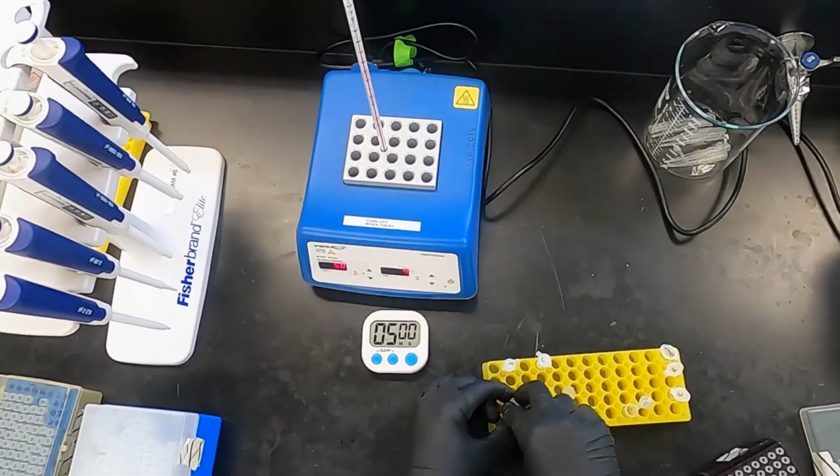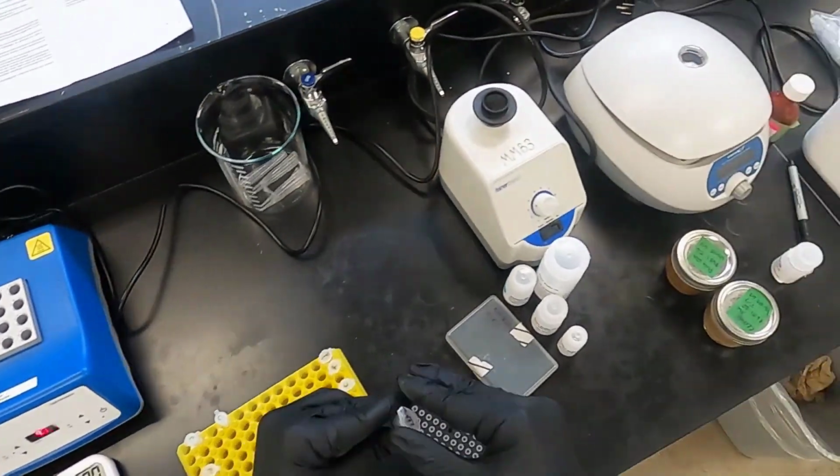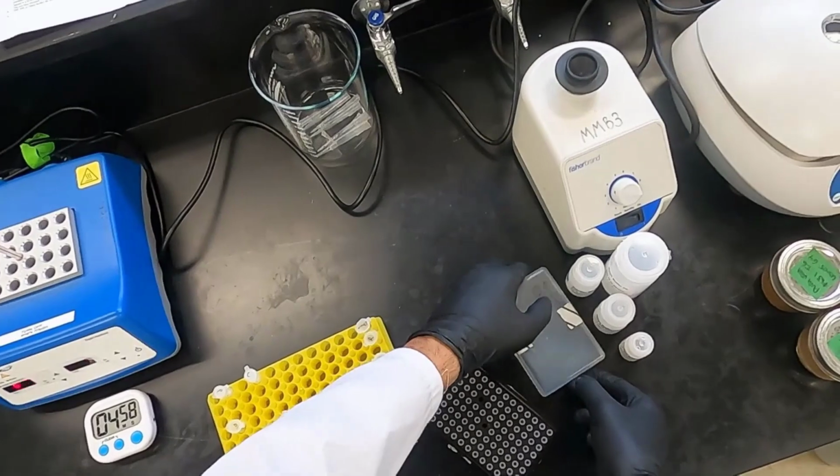Okay, so now you're going to want to incubate these for 5 minutes at room temperature. So we're going to return our RNase to the side and we'll start our timer for 5 minutes.